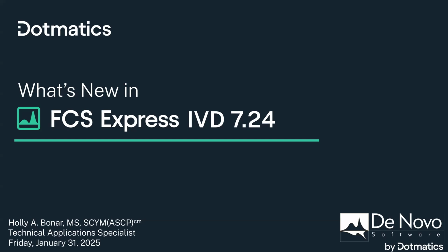My name is Holly Bonar. I am a technical application specialist with De Novo Software. Today we're going to be talking about the new release of FCS Express IVD. It's the 7.24 version. This update includes a good number of bug fixes and enhancements.